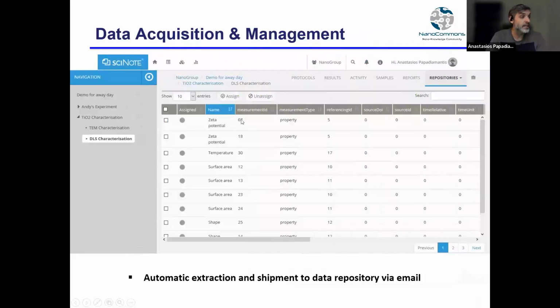And finally, the creation of a data template that then can be extracted and sent into a repository. Right now, extraction can happen by extracting this template into an Excel or a CSV format, which you can directly mail to the data manager or to yourself, etc., and then play with it accordingly.